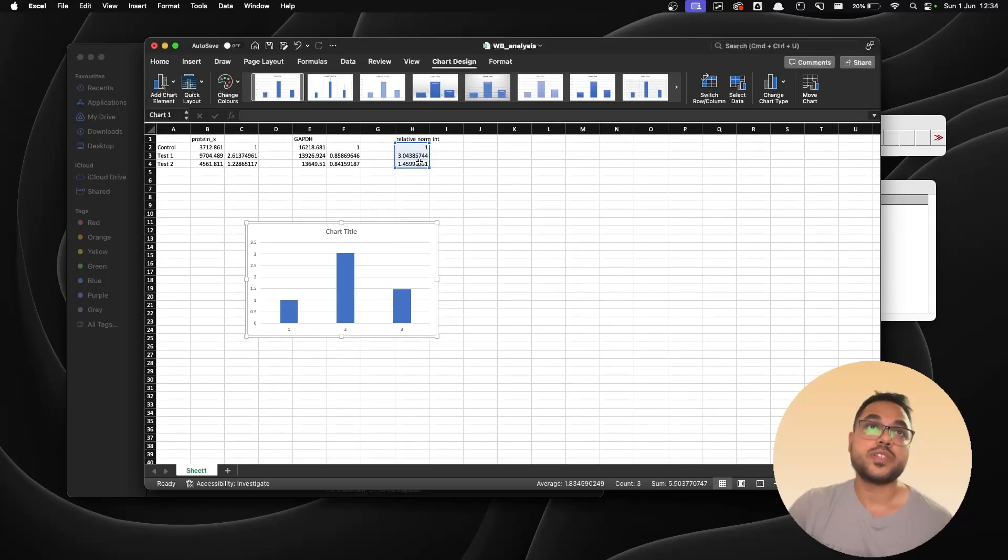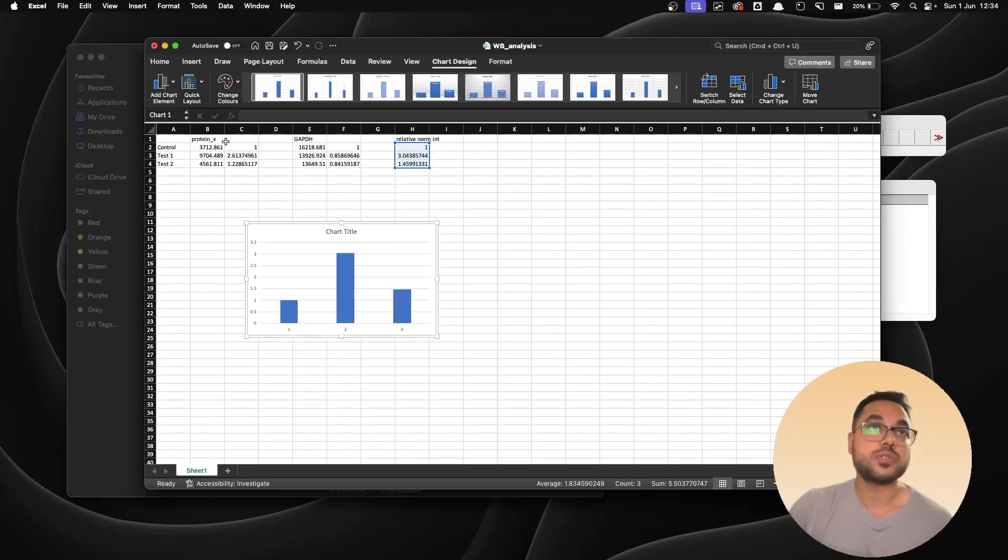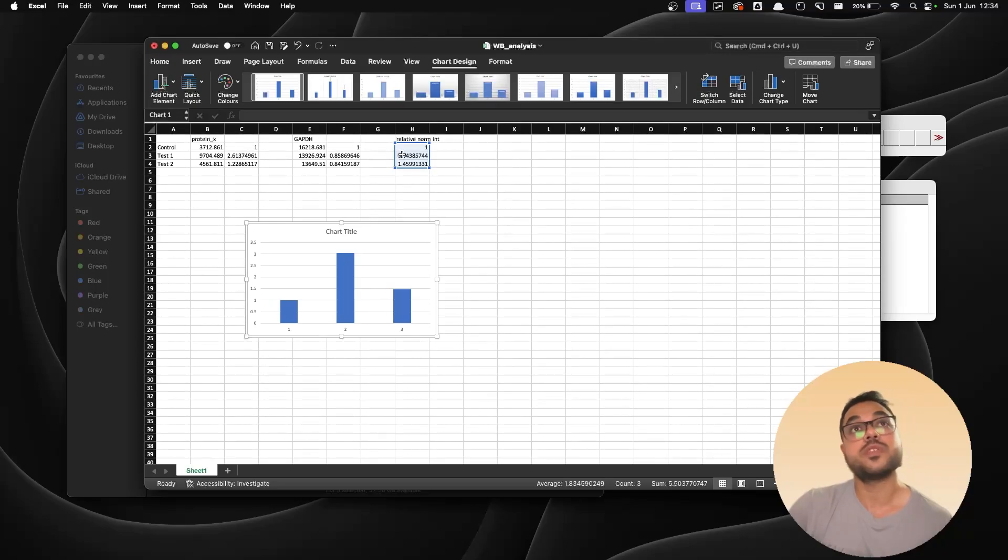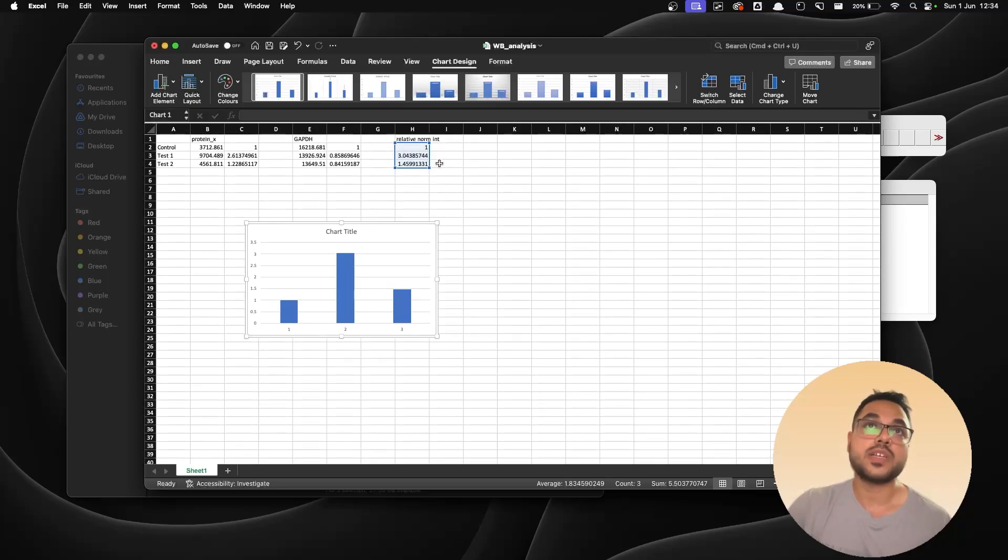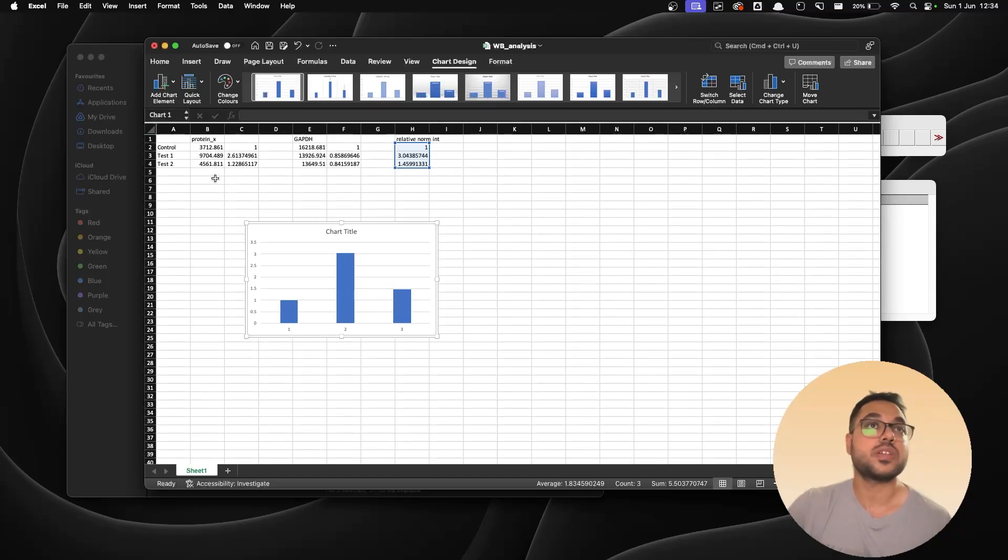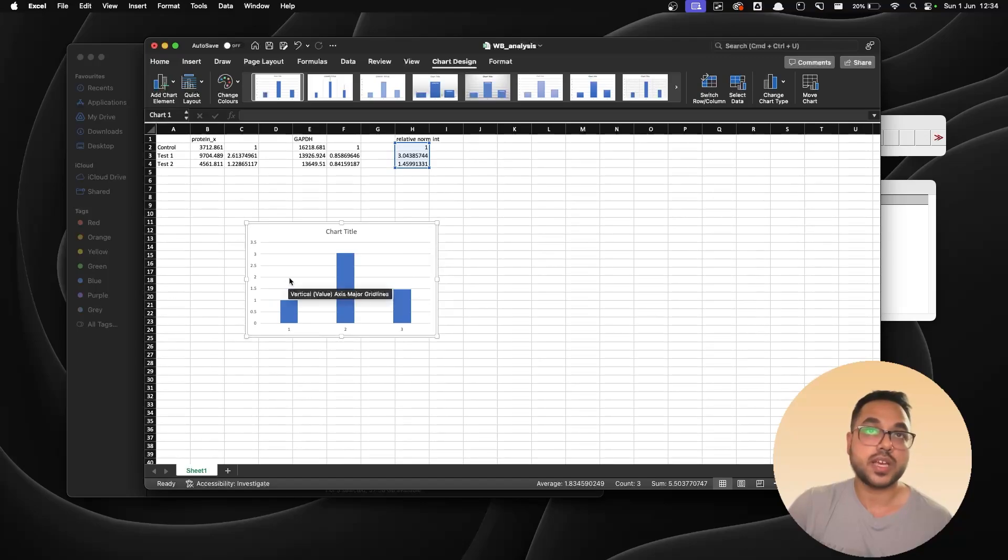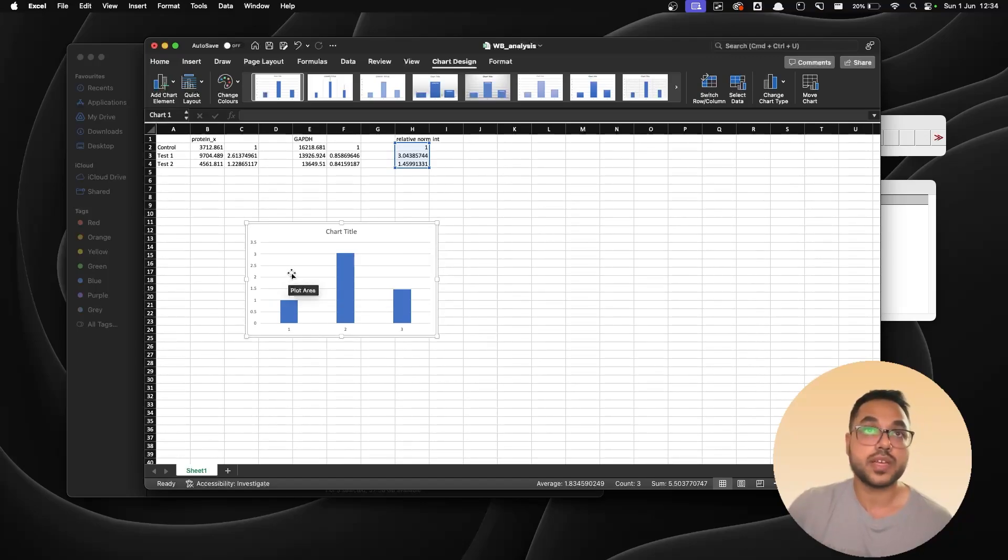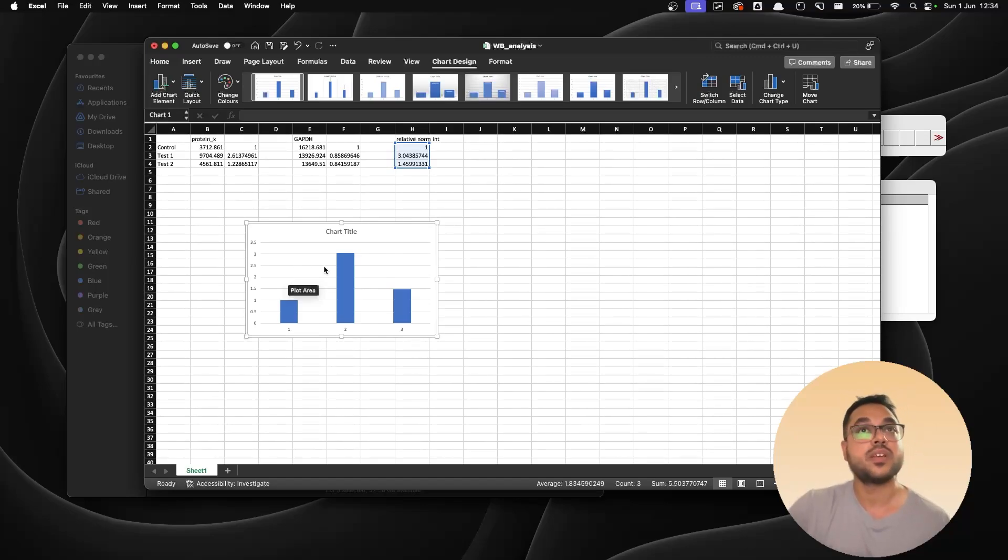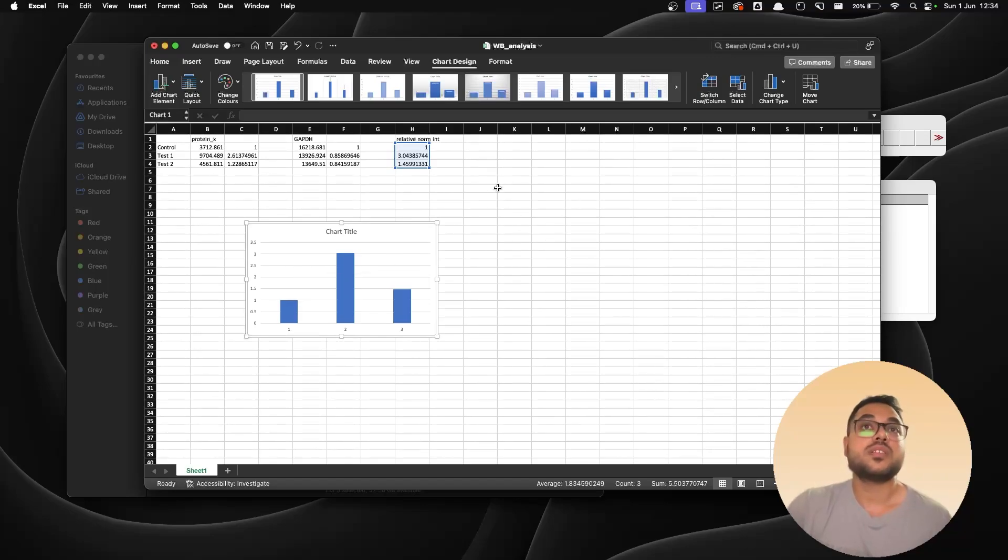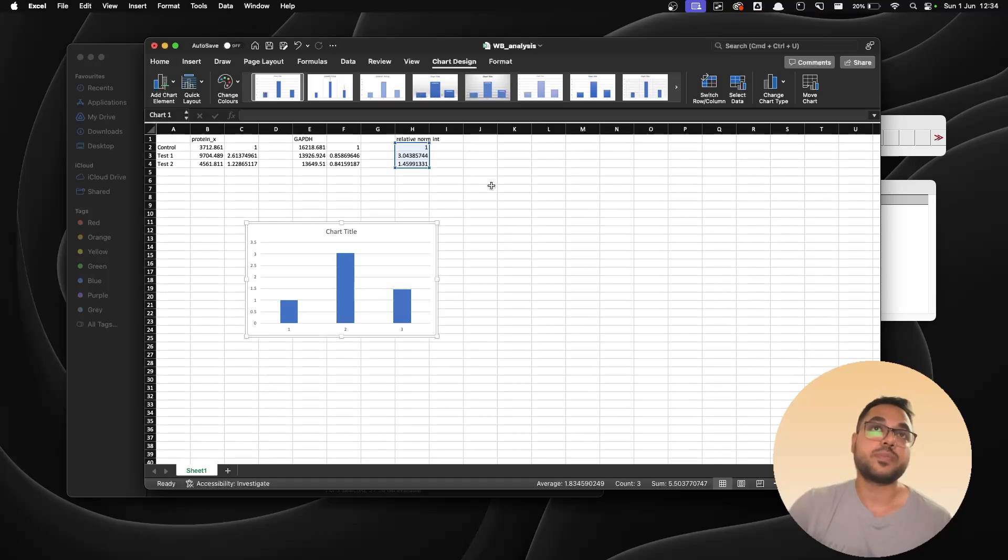So this is one blot that we did. So for protein X ideally we should be doing three blots, for GAPDH we should be doing three blots. You'll get three relative normalized intensities for control, test one and test two, and then we can do some statistical analysis and inferences based on that. We can calculate the p-value and all that statistical test. But essentially everything is going to be same, just you have to repeat it two more times with the other blots of the same proteins.